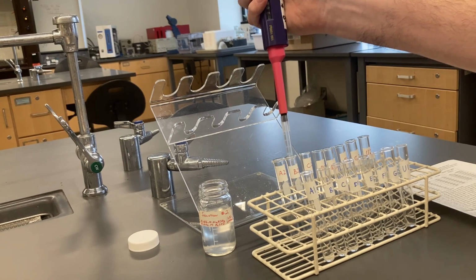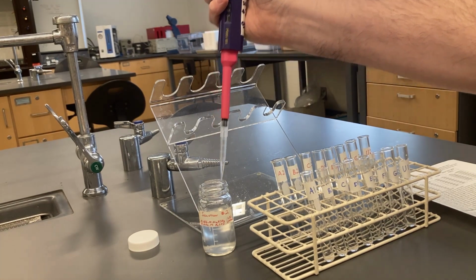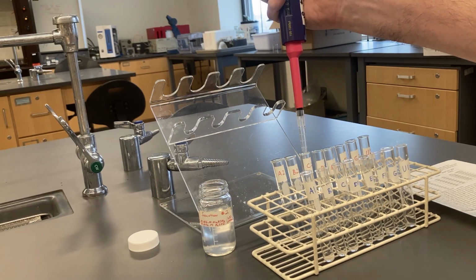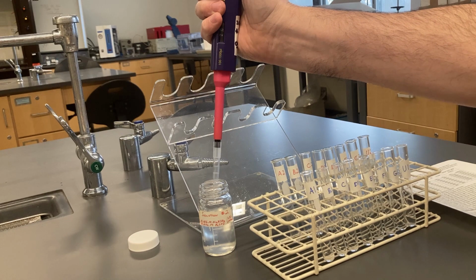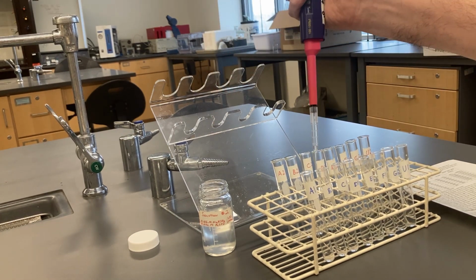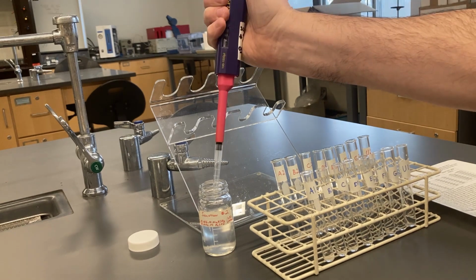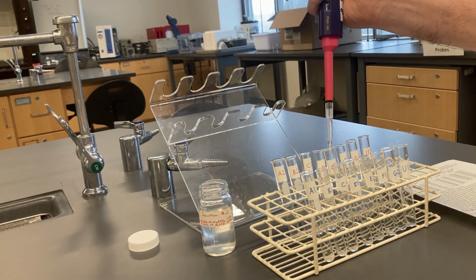I'm adding 200 to B2. 200 to C2. 200 to D2. 200 to E2.